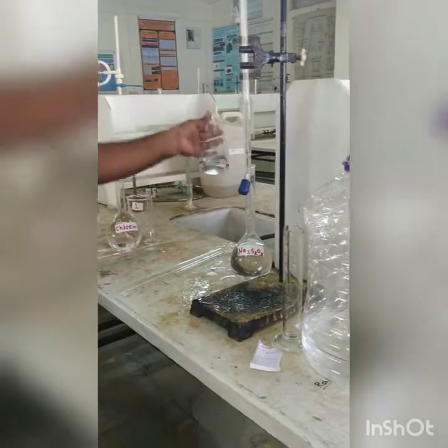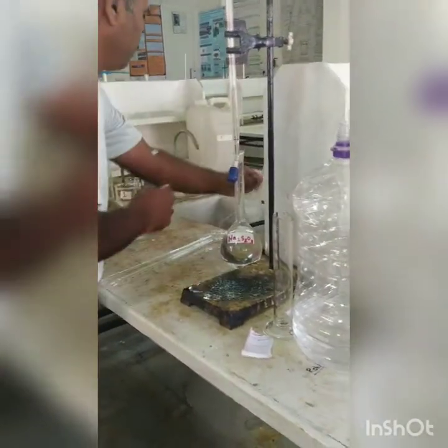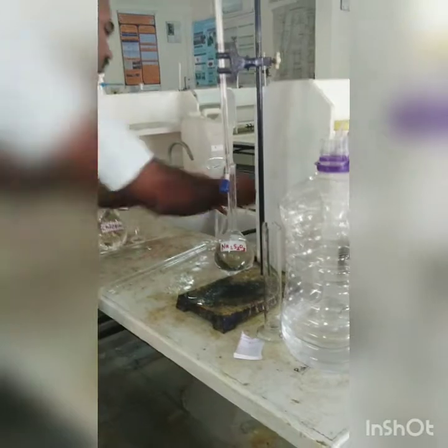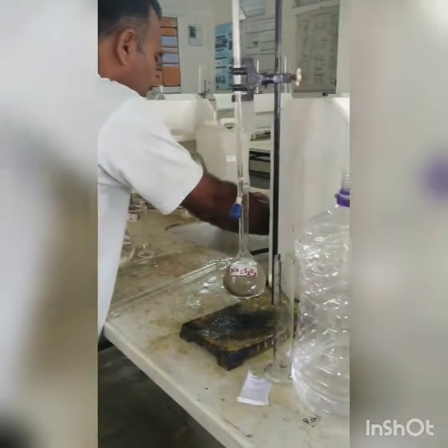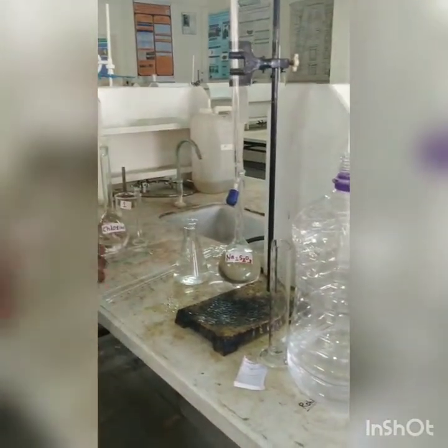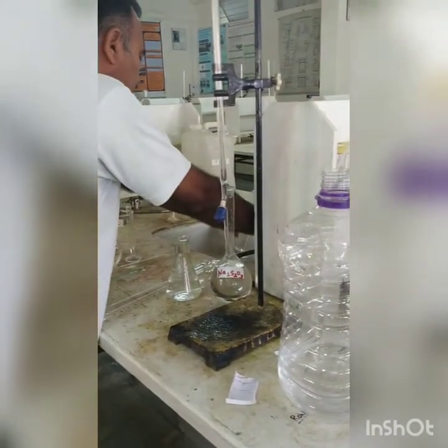If the concentration is more than 100, we will add less mL to keep the dosage the same. So 100 by X, where X is the concentration of chlorine in the given chlorine solution, and our dosages should remain the same. That we will also be seeing in the calculation part.